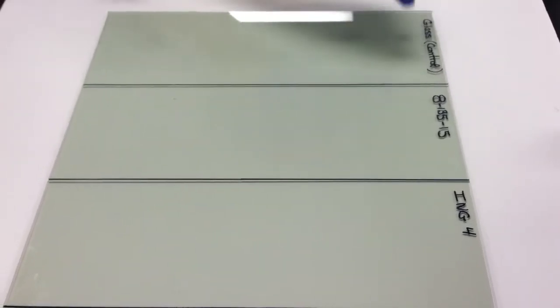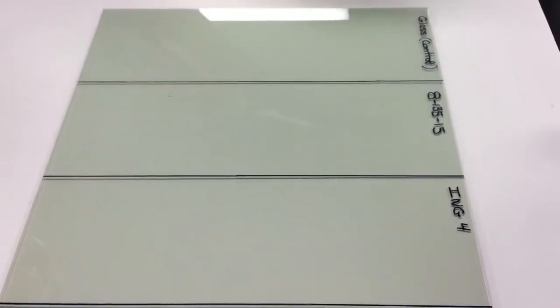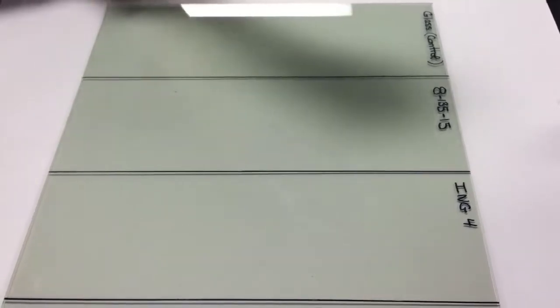What we have here is your glass control — there's not going to be a coating on that at all. Then we have National Polymers 8135-115, and then the coating that US Building provided us called ING4, as the control of their coating.